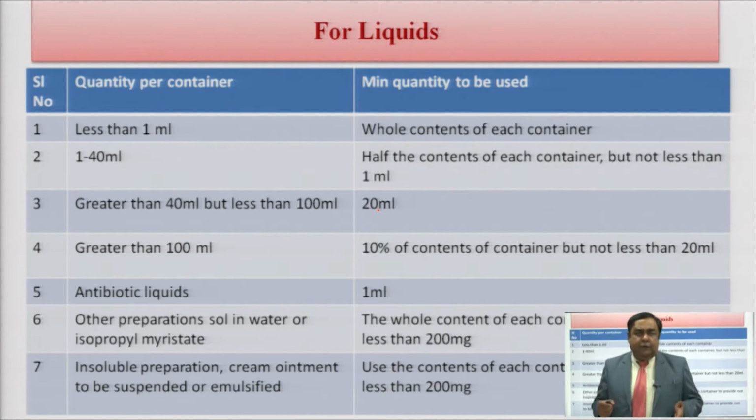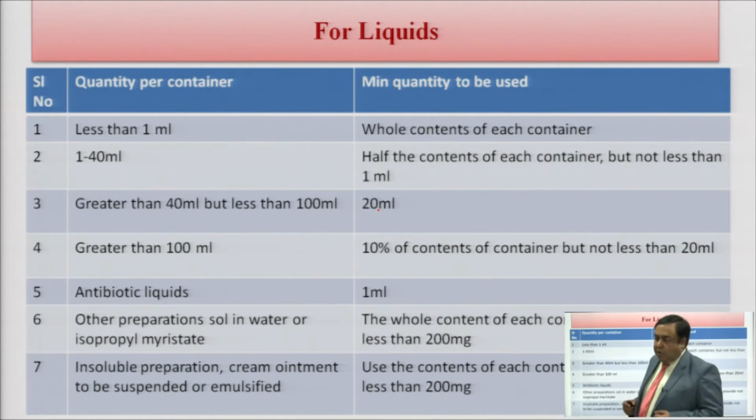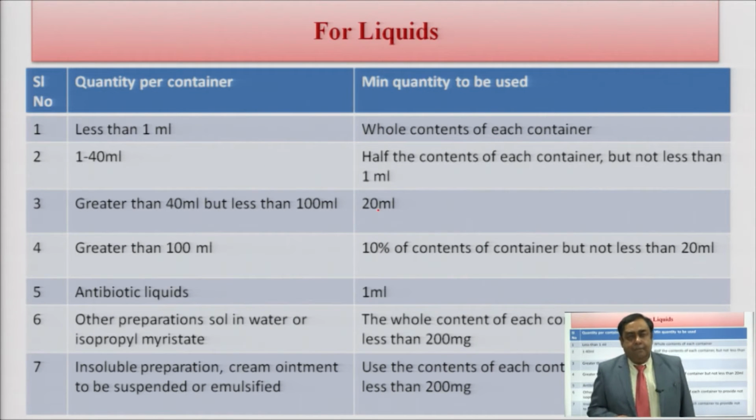If you are going to test various insoluble preparations or cream or ointment, we need to suspend or convert it into a suitable emulsion with the help of an emulsifying agent.